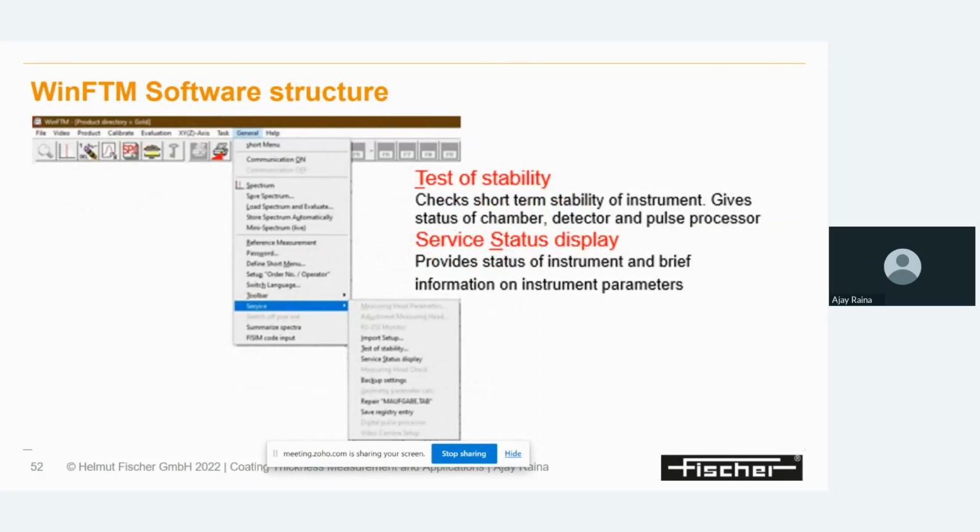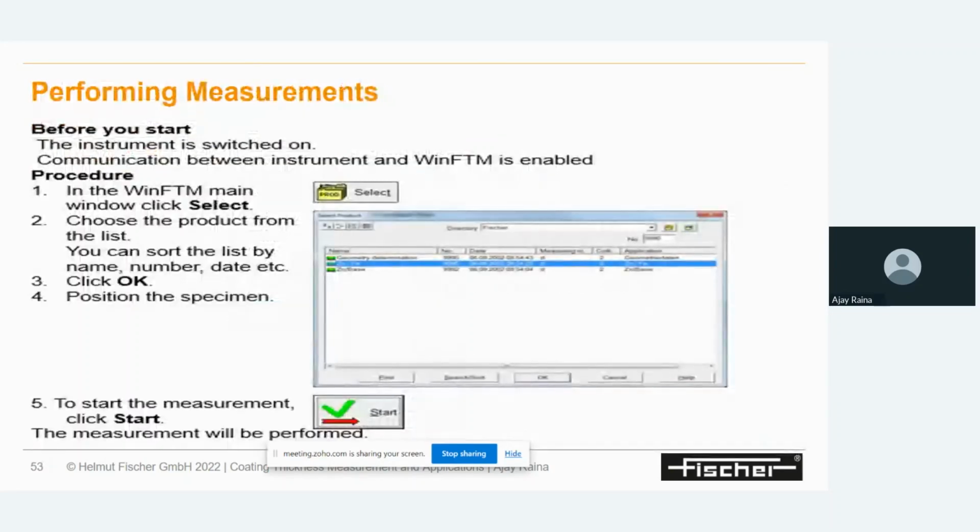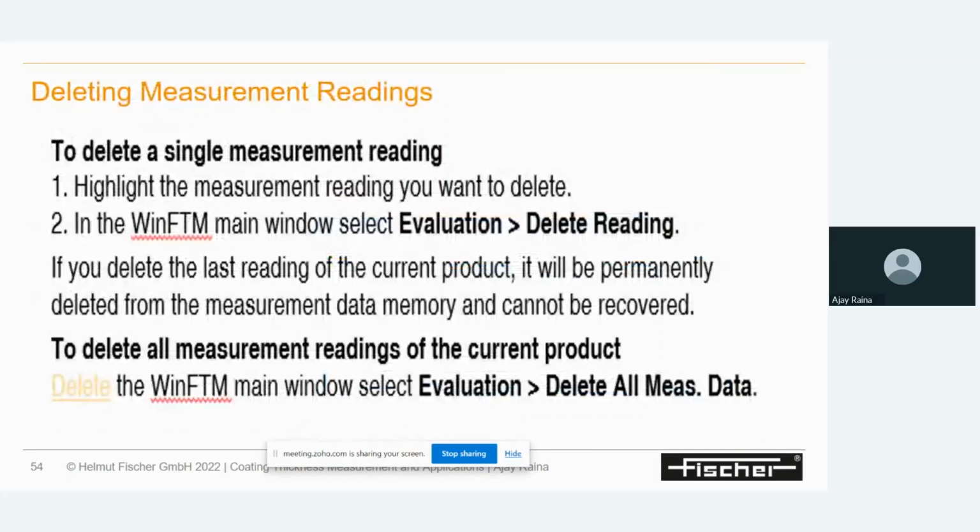The service option is available in the general category, where you can check the test of stability, whether the instrument is perfectly stable or not. Or you can have the service status display as well. Running the test is okay for everyone. I can quit these slides.